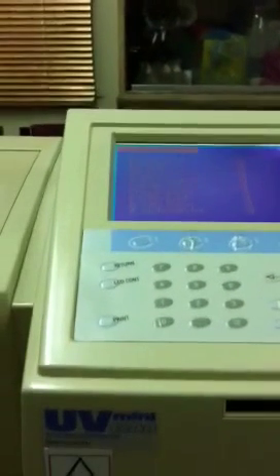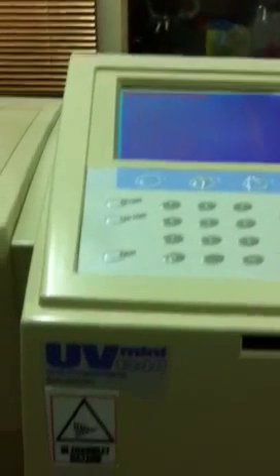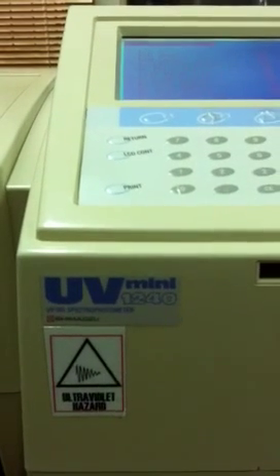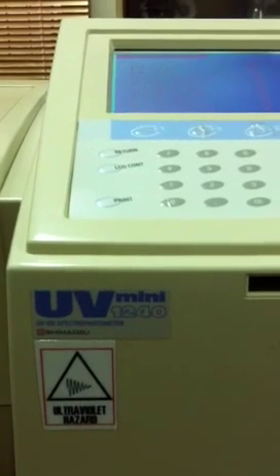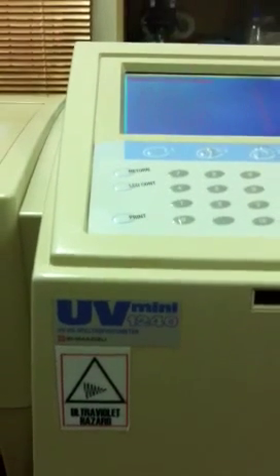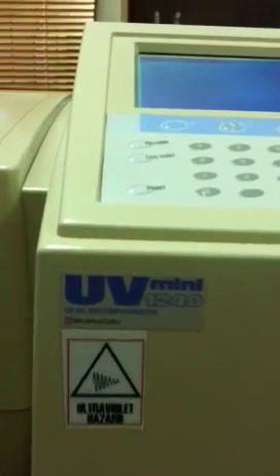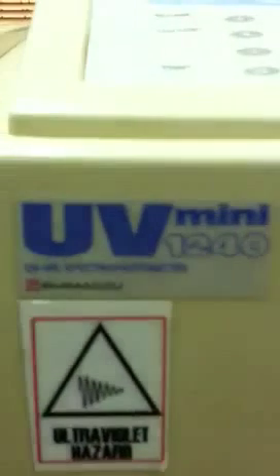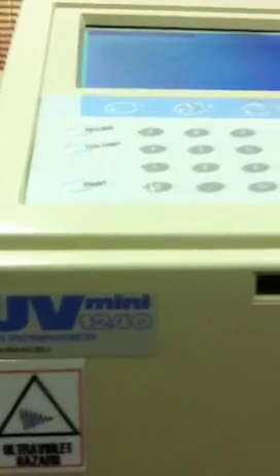One of the best known scientific instruments company in Pakistan. What you are looking at right now is a UV visible spectrophotometer manufactured by Shimadzu Corporation Japan and the model number is UV Mini 1240.